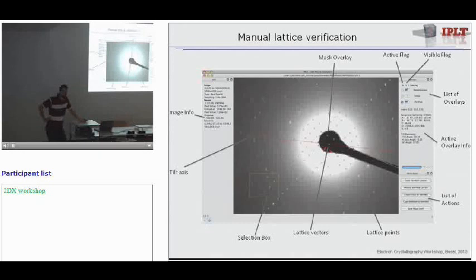You learn the profile mostly from the strong spots, the average of all of them. And the effect of it is most helpful on the weak spots. So you probably get a factor of 2 on weak spots by using profiles that have been learned from the strong spots. And all the X-ray people, I mean, there's nobody not using profiles. So I think it's a way to go. There are more parameters, and of course, therefore there are more things to go wrong.